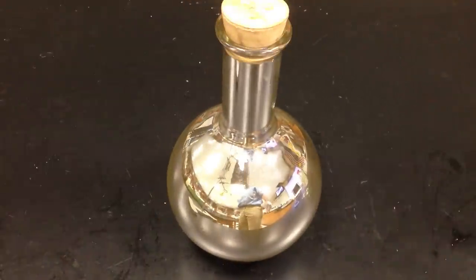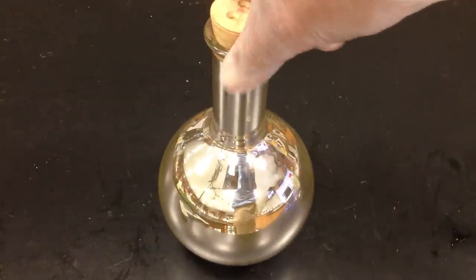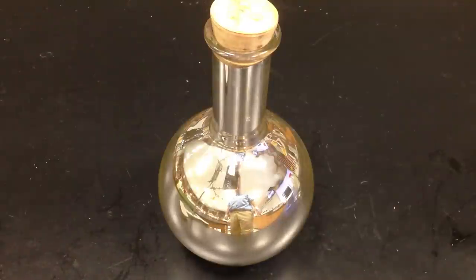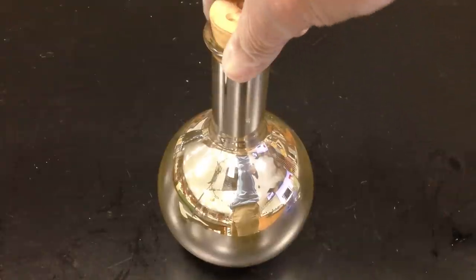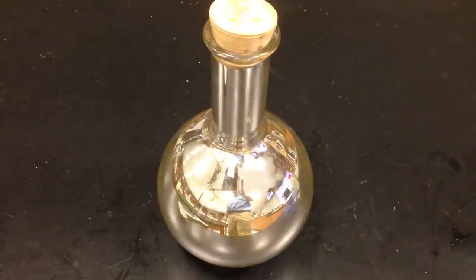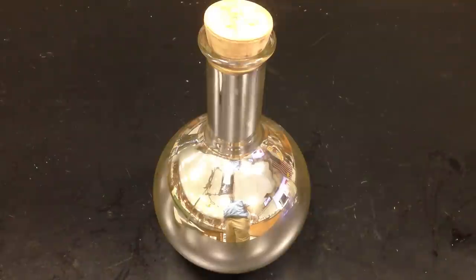Now, similar to Simons Dugrowski, what do you do with that? Well, I can look at it, but I also could take it away. Silver is a metal that doesn't react too well. So in order to take the silver off, I would need a strong, very strong oxidizing agent.